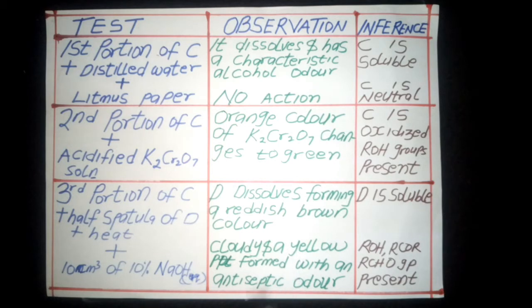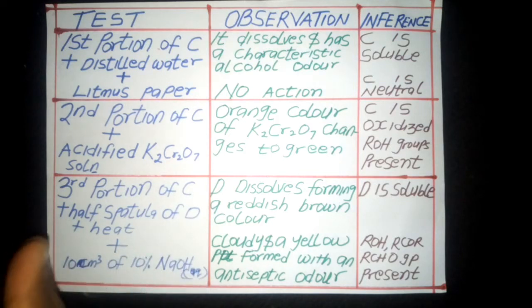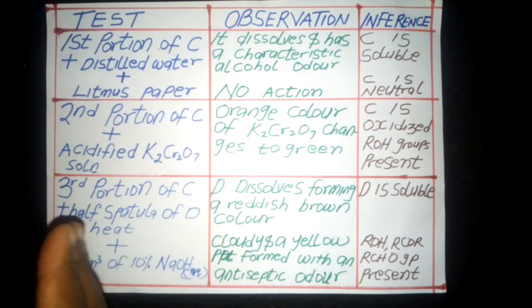Then for alcohols, there's primary, secondary, and tertiary alcohol. So methanol doesn't undergo this, ethanol undergoes it like that. Propan-2-ol, of course, when you're given, that is a secondary alcohol. It undergoes this. So that's what I did.